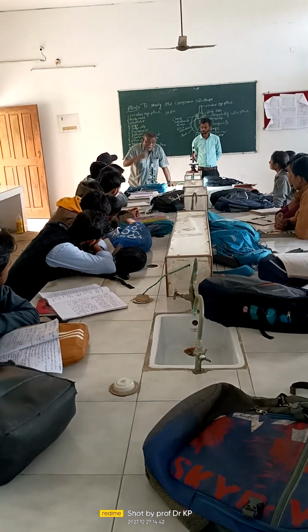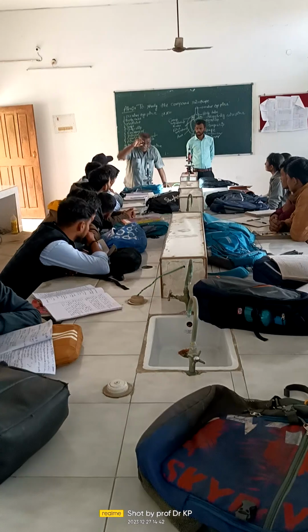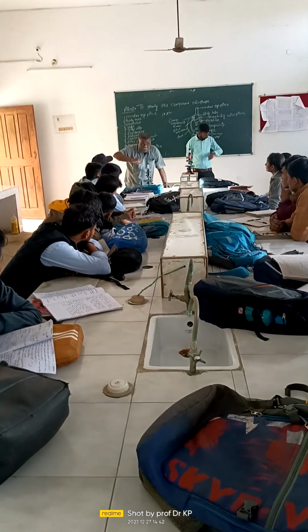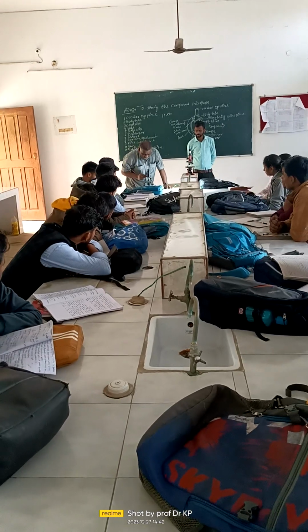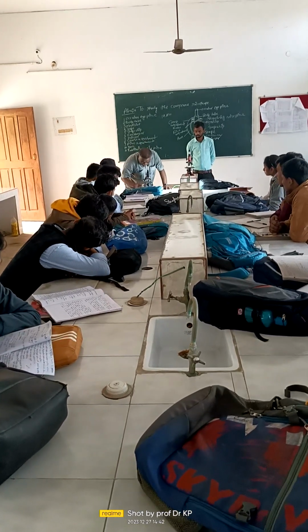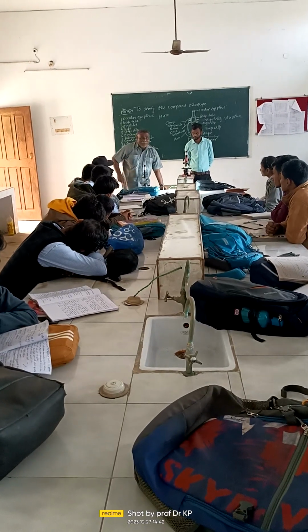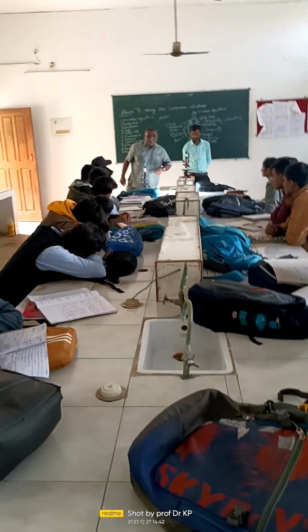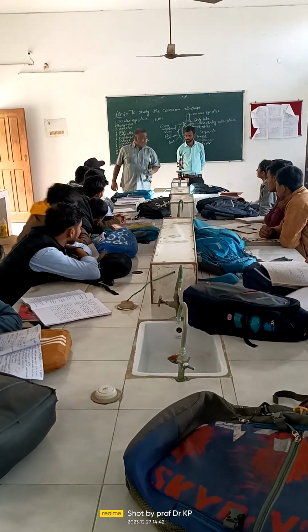When you touch it, disaster. Immediate break. Either the glass slide will break or the cover slip you are using will be broken. You understand? So now you have to use only the fine adjustment, increase the light a little bit, and use only the fine adjustment to focus at 45x. Immediately the structure will appear. This is the way to use the microscope in the laboratory.